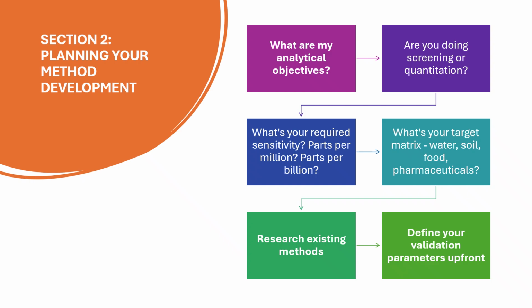Before you touch any instrument, successful method development starts with thorough planning. Ask yourself these critical questions. What are my analytical objectives? Are you doing screening or quantitation? What's your required sensitivity? What matrices are you going to analyze? Research existing methods. Define your validation parameters upfront.